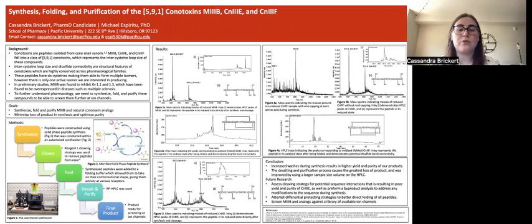If you look to figure 4A and B, this is showing the crude form of peptide CnIIIF, which is the last peptide that I synthesized. The mass spectra in figure 4A is actually a separate synthesis from figure 4B. In figure 4A, we use a synthesis technique known as end capping. This can be done after the coupling stage that I spoke about earlier to stop any unreacted amino acid from reacting with our peptide. This helps prevent any deletion products from forming, which are a form of impurity.